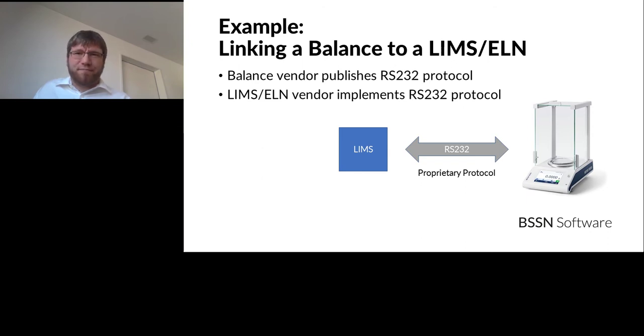Now, if I want to reuse that same device that I already have connected to my LIMS, but use it from my ELN, well, the ELN has a completely different driver architecture, so I can't reuse the driver. So it's really a one-to-one connection that I build all the time. And from a total cost of ownership perspective, that's a nightmare, right? But still, we do it. We do it because that is the status quo. And that's what we are working on changing with SiLA and AnIML.